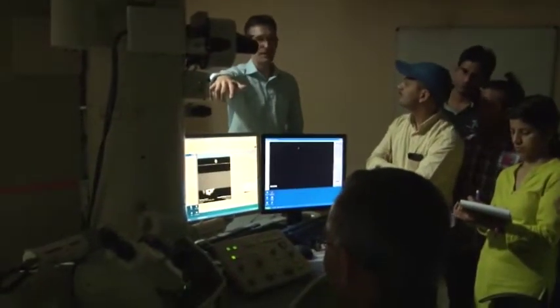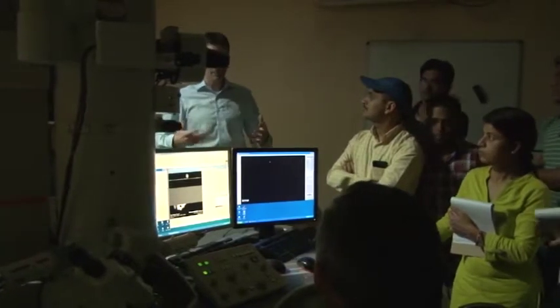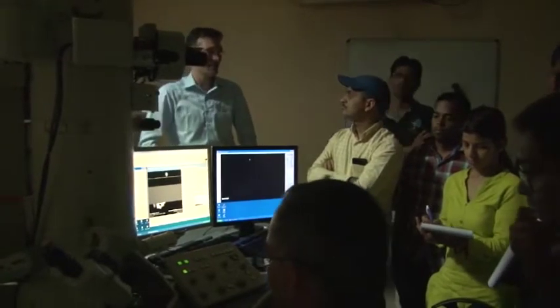If you look at the spot, there's also some intensity asymmetry. Yes, which is severe. And this is also another indication for a misaligned aperture. So I would say with some expertise and experience at the microscope, you get into those details.